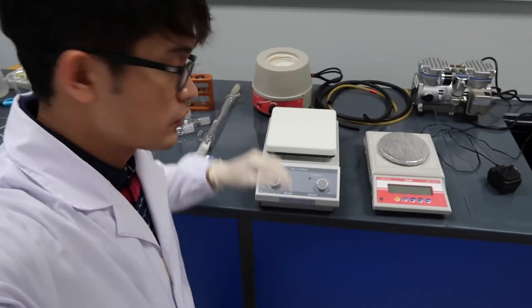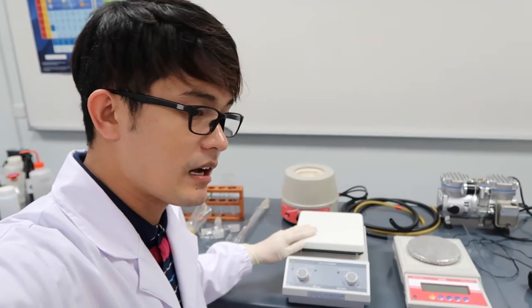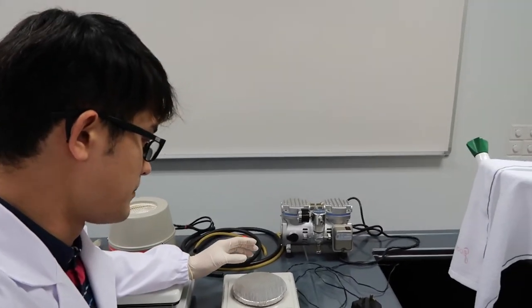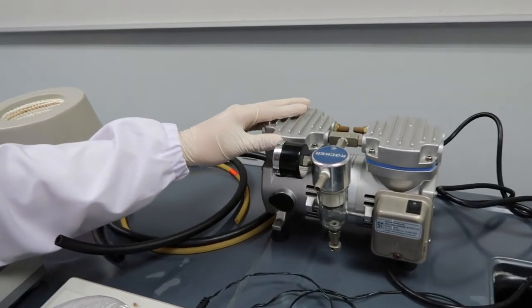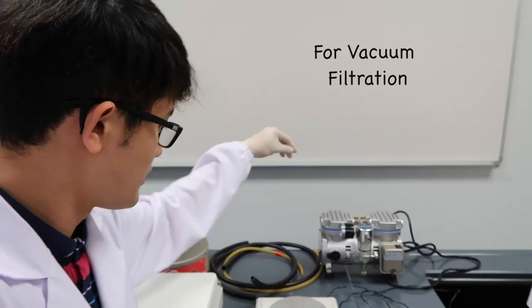This is a hot plate stirrer. It's used when you're dissolving a solid in distilled water — solutions that need constant stirring for a long time. You can also introduce heat via the temperature control. This is the weighing balance, used to weigh solid chemicals using a weighing boat. This is the electro mantle, now commonly used for round-bottom flasks. And this is the vacuum pump, used for vacuum filtration.